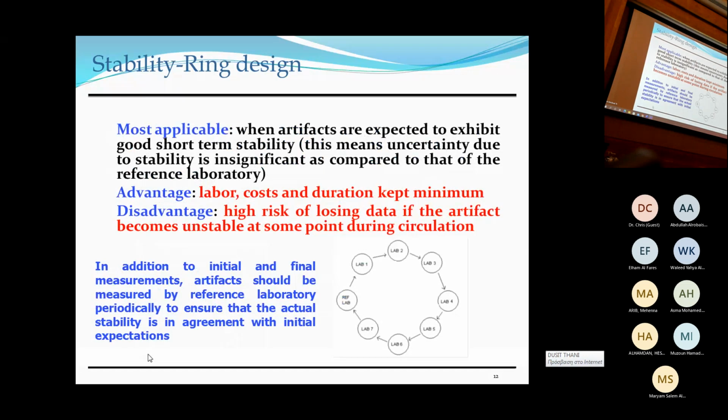There are variants to all of these. For example, what comes to mind is the 1 kg mass key comparison that we did in GulfMet. Two standards were sent out, and it was required that the difference and the sum of these two standards was determined.